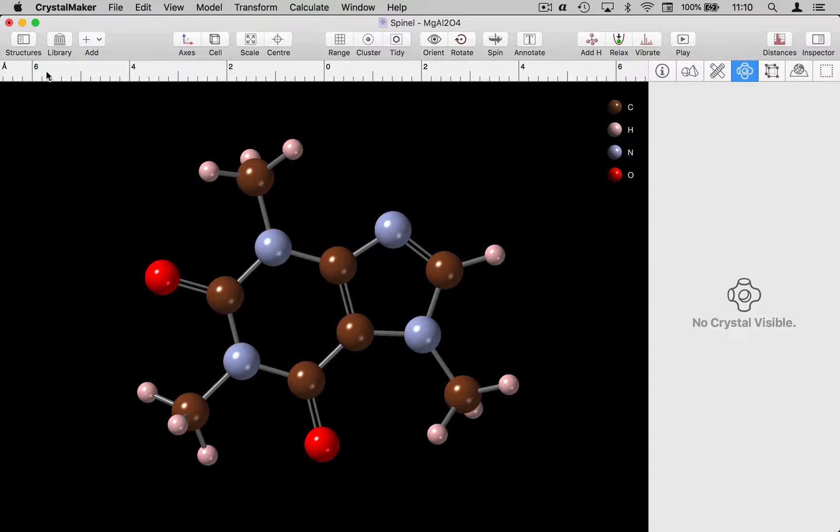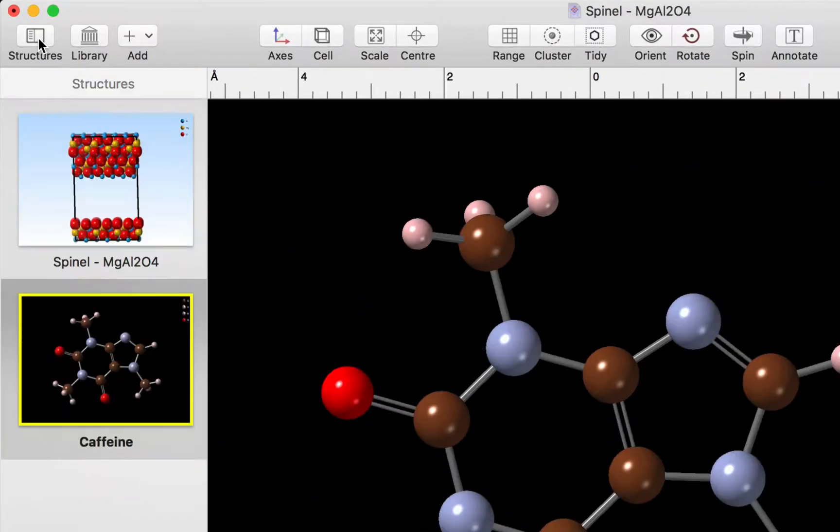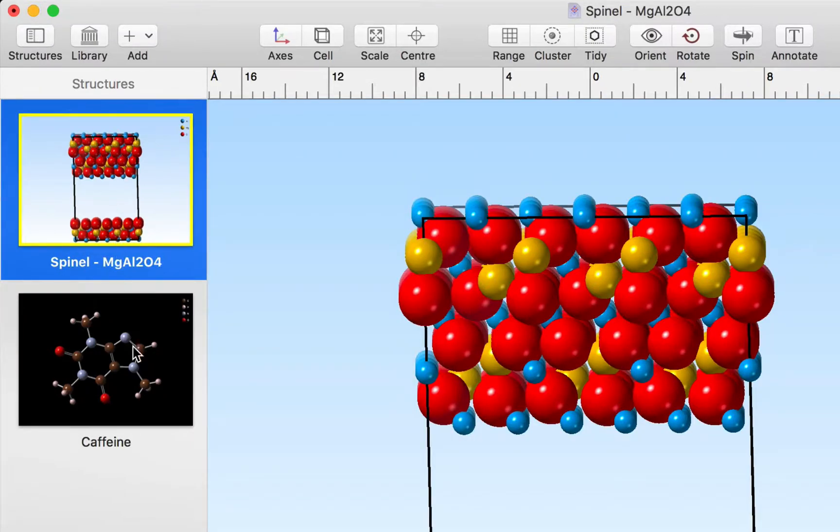Now where's that gone? If we open up our structures list we can see we've got two structures in the same document and currently they're separate structures.